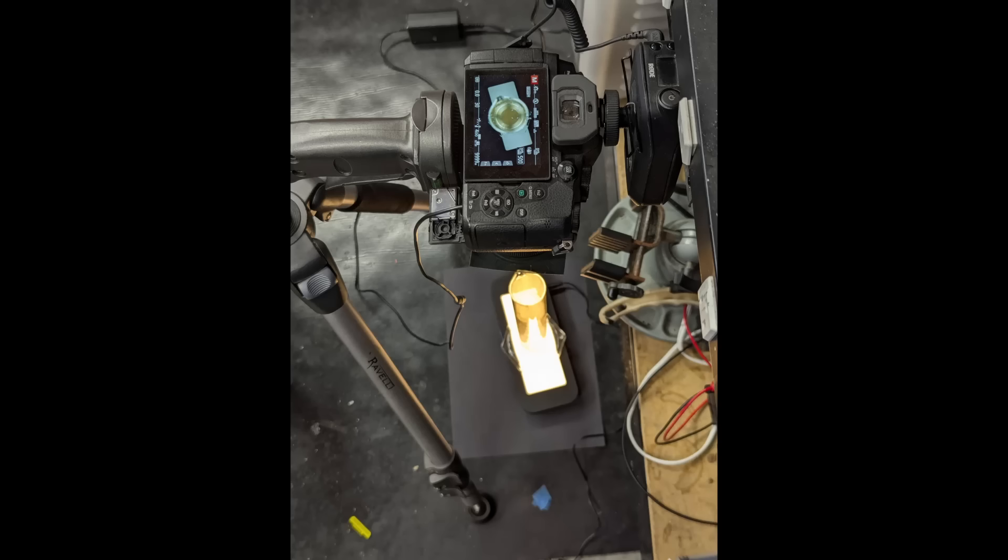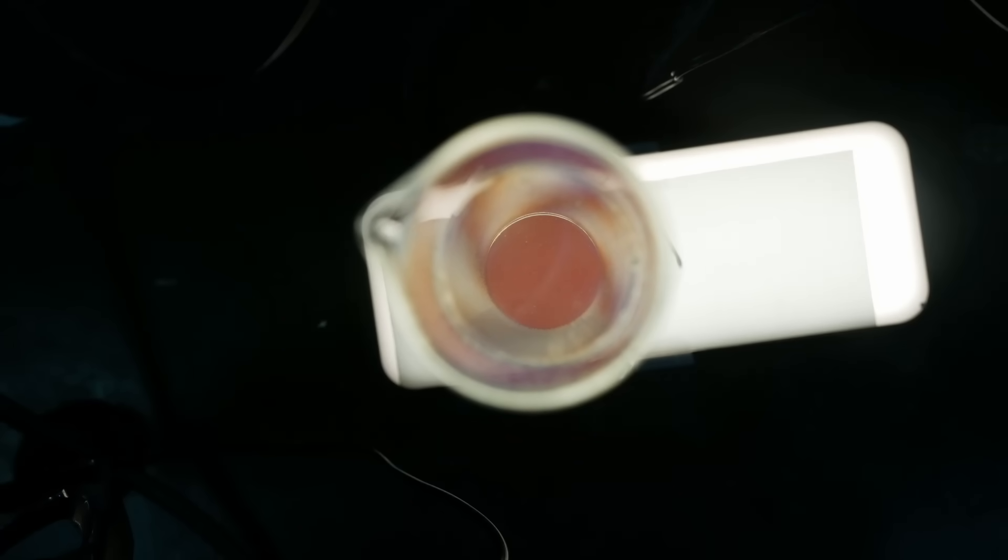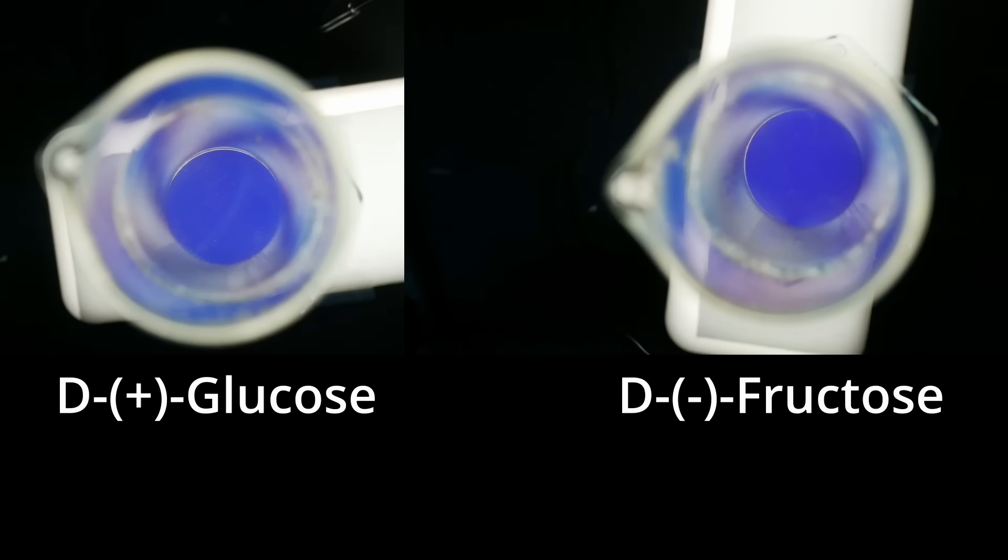When we look down through a tall graduated cylinder of a sugar solution, of course you can see the color change, and that's because this optical rotation is also wavelength sensitive. But if you look at the reflection in the graduated cylinder, you can see these four radial arms that are also twisting, spiraling. And as it happens, when we look at glucose, they spiral to the right following the right-hand rule. And when we look at fructose, they twist the other way. It's following the left-hand rule.